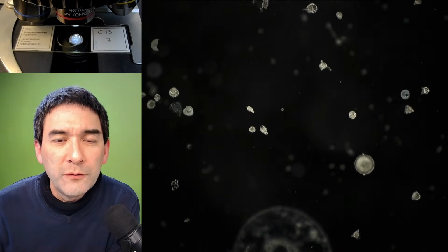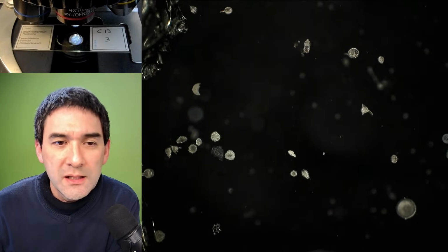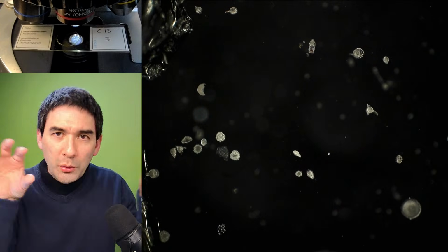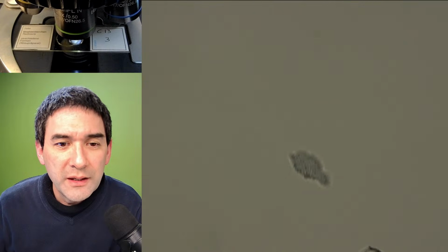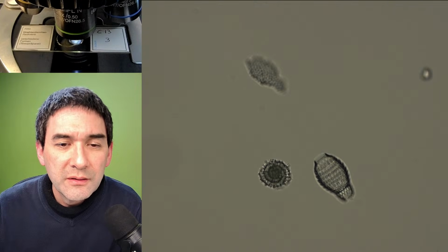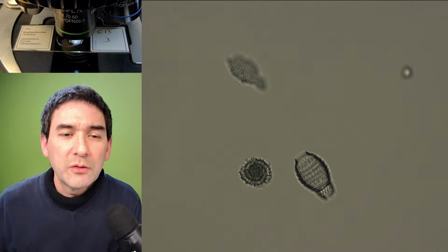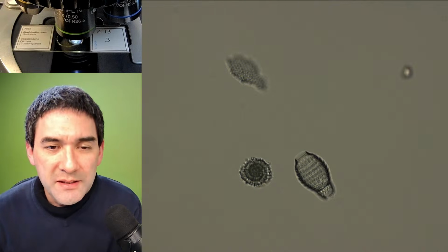Unfortunately, I only have dark field with my low power. Yes, they are amoeboid cells, and apparently those pseudopodia, those extensions, are able to extend out of these holes that you see there in the shell. See, I lost the focus again. But you see those tiny little holes here, right? In those shells. So they're quite nice. So they're basically marine.